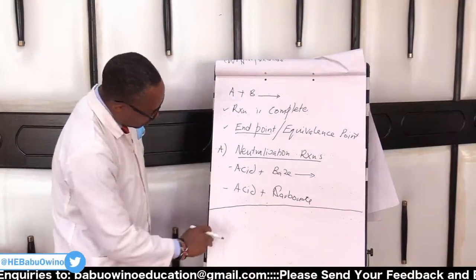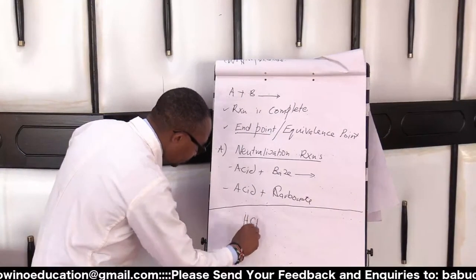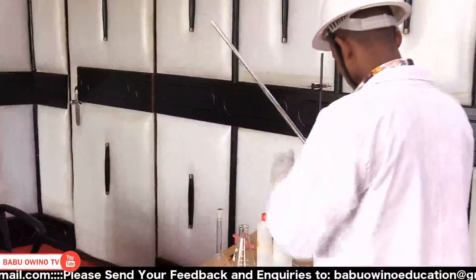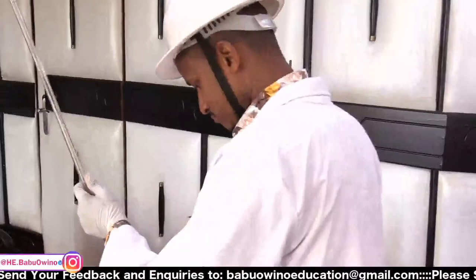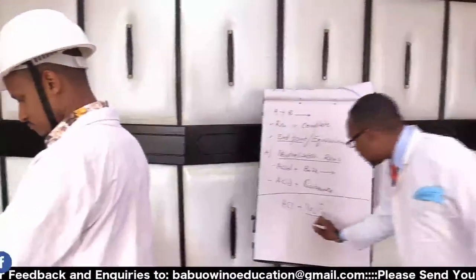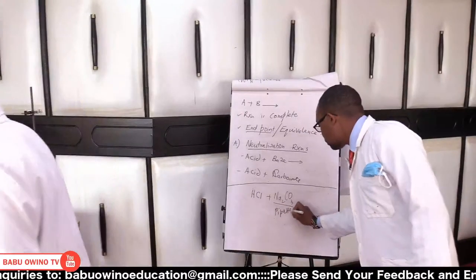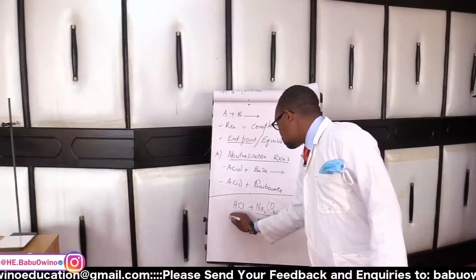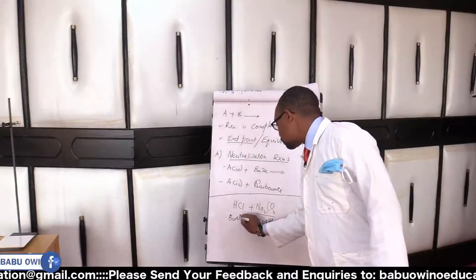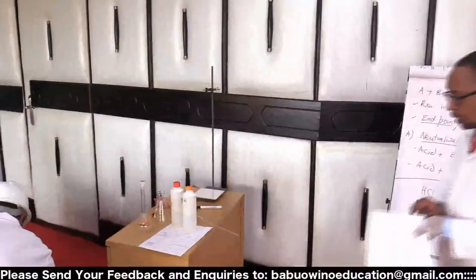We are going to allow Mheshimiwa to take the acid HCl and place it in a burette. And then we titrate against sodium carbonate. So the sodium carbonate will be in the pipette, while the HCl will be in the burette. So we want to see now Mheshimiwa doing the experiment.